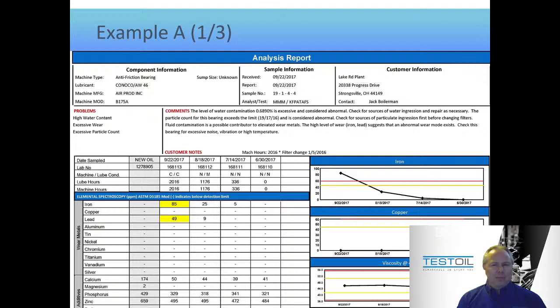So I caution people when they simply think filtration will fix everything, make the whole report look better. Because what I'll also point out is, a particulate filter is not going to take out the water. And that's when they go, oh, right, forgot about the water. I go, exactly. So I said, what filtration should we use?